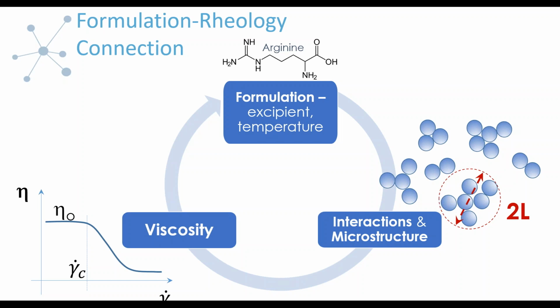What happens when you're formulating a complex fluid, in this case a protein solution, and you're varying the components in the formulation or even the environment the formulation is experiencing, and we'll talk about temperature impact today, is that you change the way the components in the formulation are interacting.